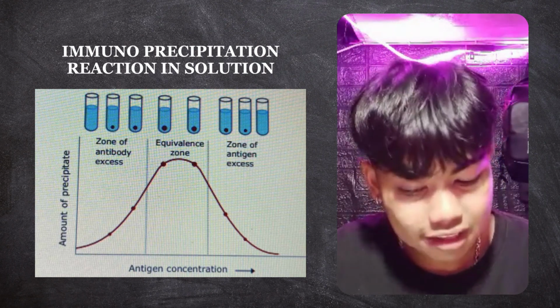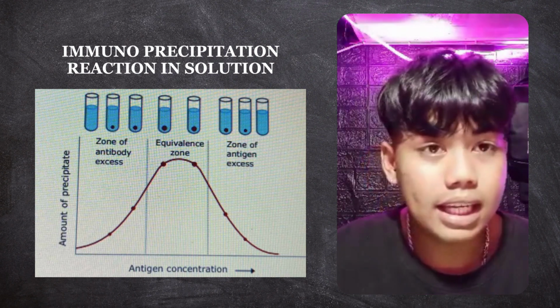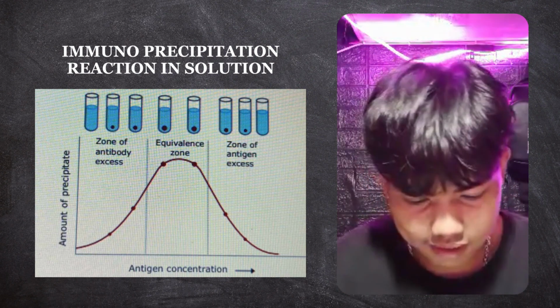Next one is staining. The gel is stained by dye.